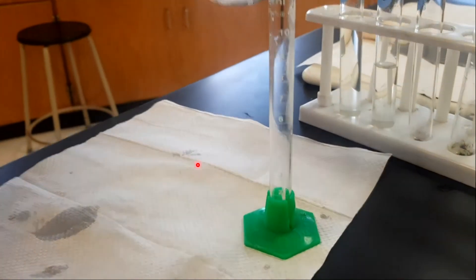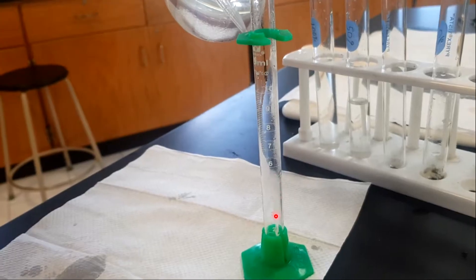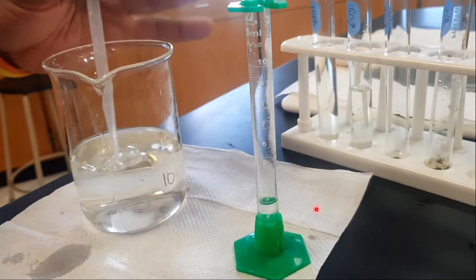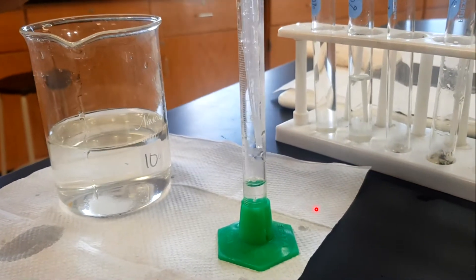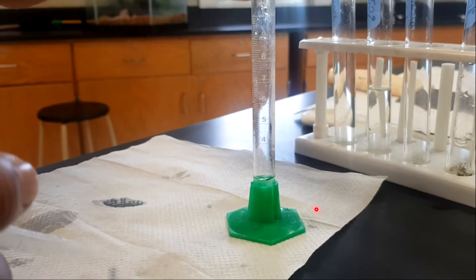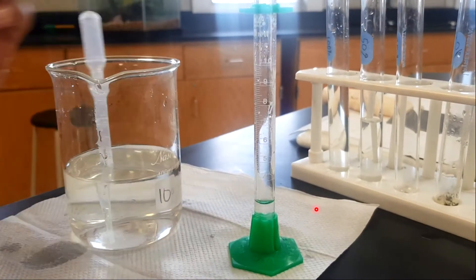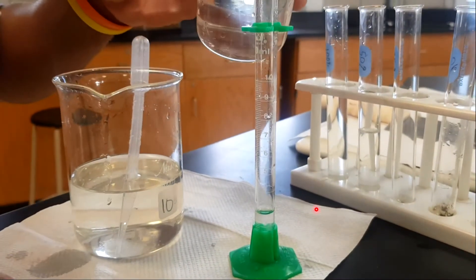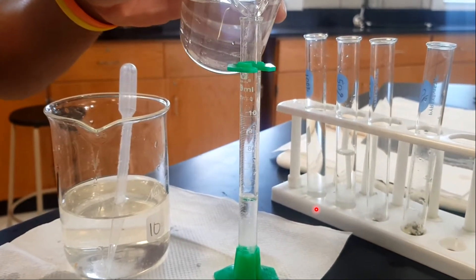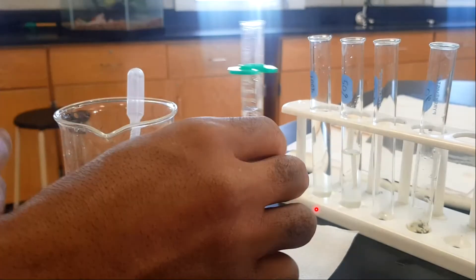The next one I'm going to measure out is my 25%. To get this, put in 2.5 ml of the concentrated sugar solution first. Be extremely careful while measuring — you could go below first and then slowly top it up. Once you have done that, pour in your distilled water and bring it up to 10 ml. That will be your 25% sugar concentrated solution.